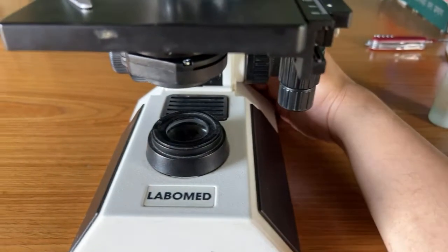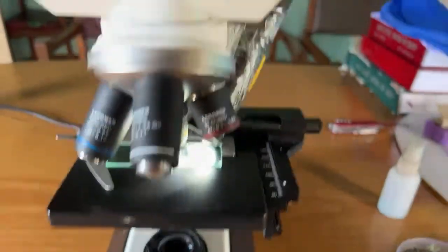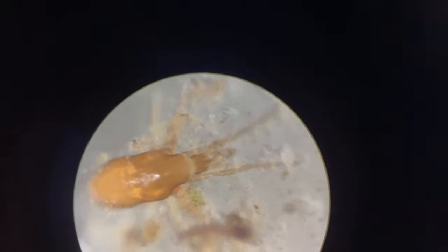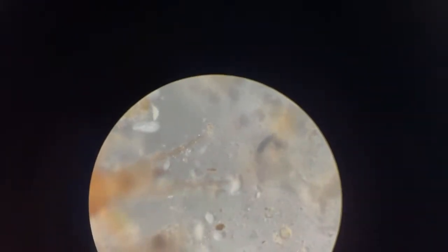And now what I'll do is I'll switch it off, switch this on, and now you see a more realistic picture of it, right? Now you also see some protozoans in their jelly-like color, in their white gelatinous forms.